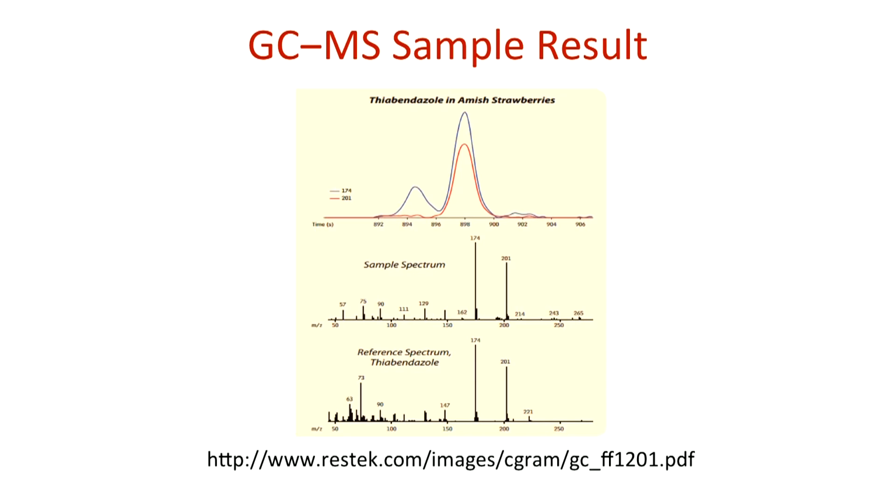The second figure here is basically the ion fragmentation pattern. So the x-axis is the mass to charge ratio. And then typically they have libraries, so you can compare your fragmentation pattern to the fragmentation of a compound in a library, and if they have a high percentage of match, then you're able to identify your sample.